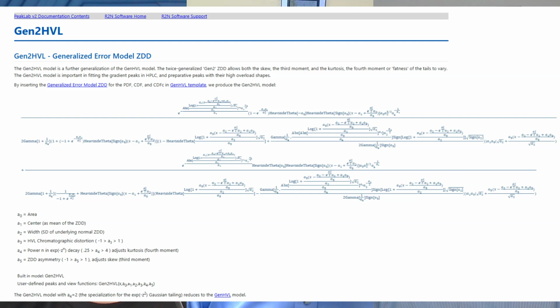And again, the key is you do want these models to have a perfect mass balance. Everything that goes into the column comes out. You can't have some missing component somewhere in the system.